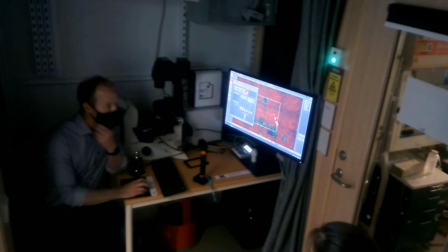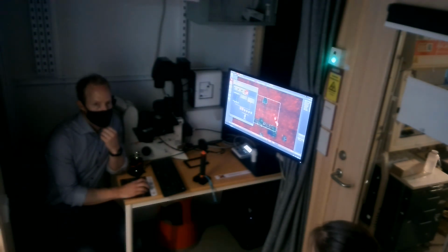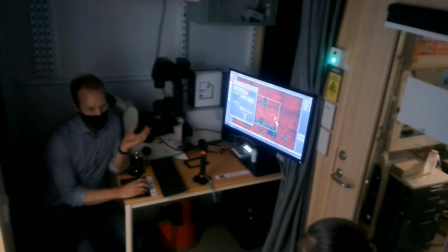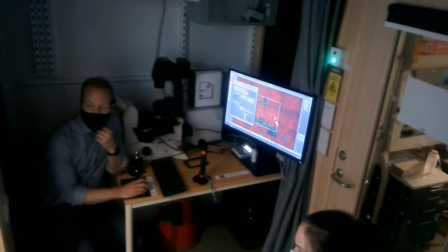In most cases, I would say no, would be my first impression, but it depends on your sample. In bright field, what gives most contrast, which is what it's looking for, might not be at the same level as your fluorophore. But you usually don't have the contrast stain together with the fluorescent stain. In bright field you can make a sharp adjustment with the phase contrast, but the phase contrast is more like focusing on the edges and not on the inner content.